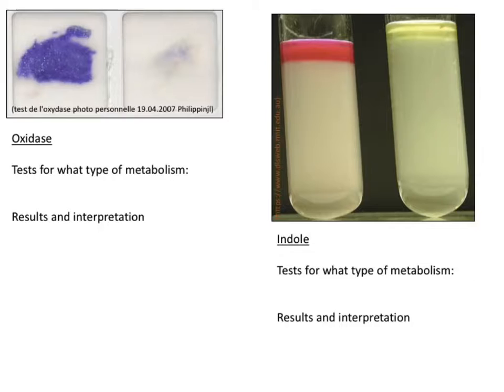You or your partner grab one of the plates and do a T-streak on a new agar plate so that we have fresh culture to work with, and then make a fresh broth culture as well. I will put a test tube rack for each lab section in there so you can put them right into that rack, and then I'll put them where they need to go to grow. The plates you can just stick right into the incubator.